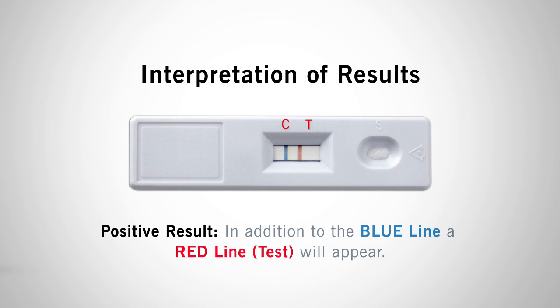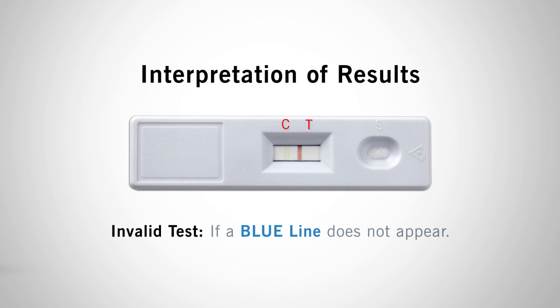The intensity of the red line will depend on the gluten residue present in the sample. If a blue line does not appear, the test is considered invalid. Repeat the test with a new lateral flow device.